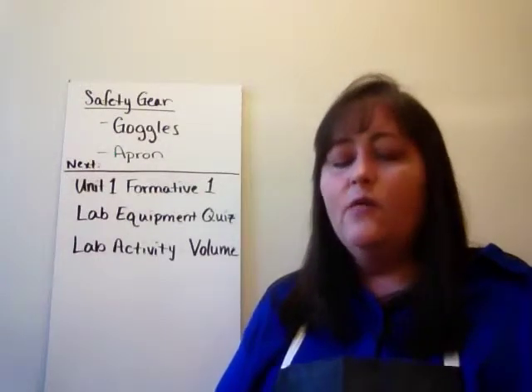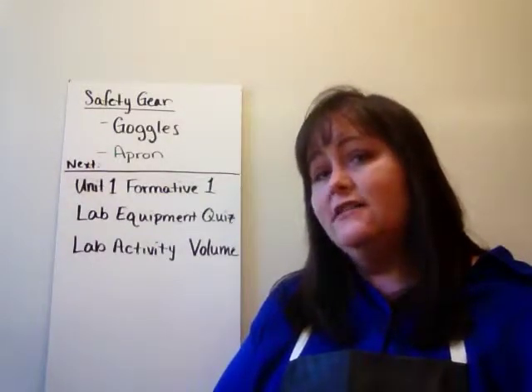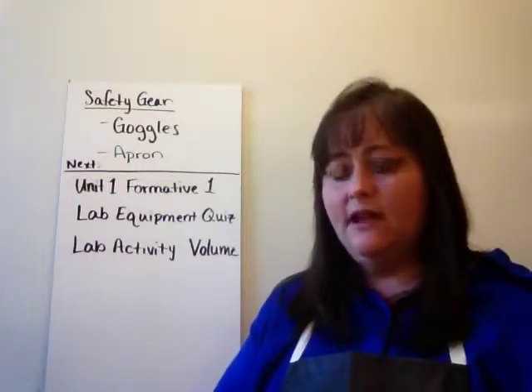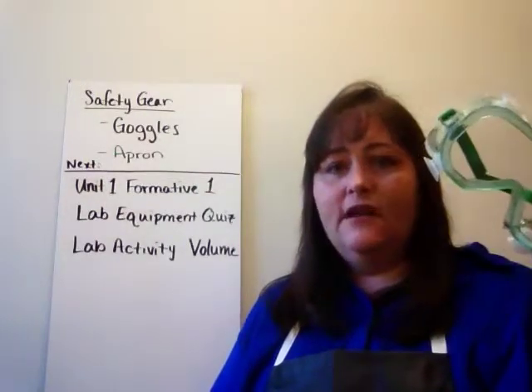Most of the time, once you finish your lab and you have cleaned your station up, then you can take your goggles off. There are times that you cannot take your goggles off even if you're done because the people next to you are not done and the lab is dangerous enough for me to say, leave those on. So make sure you wear your goggles at all times.